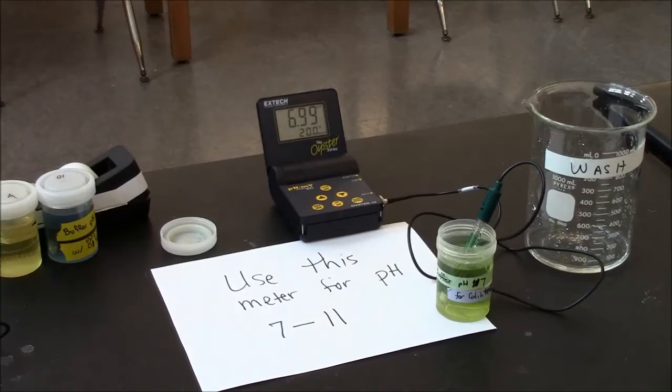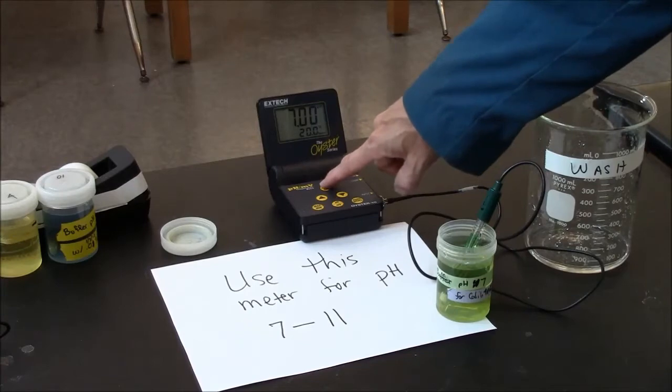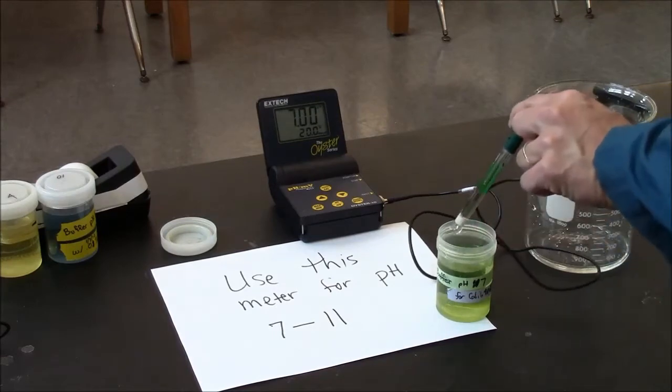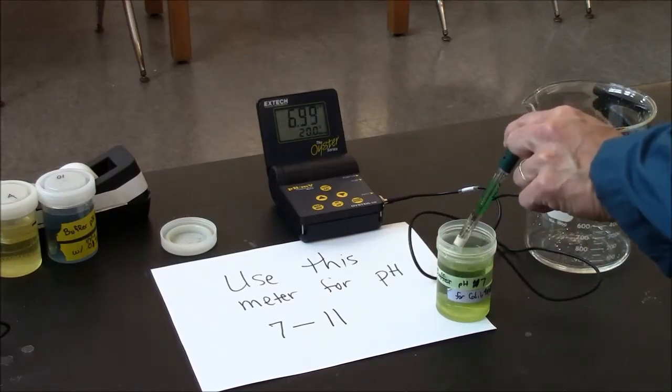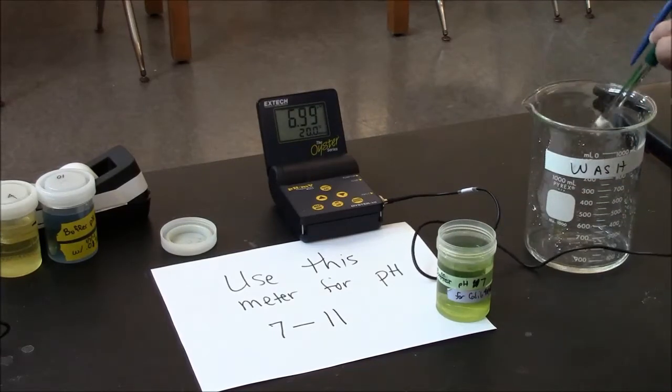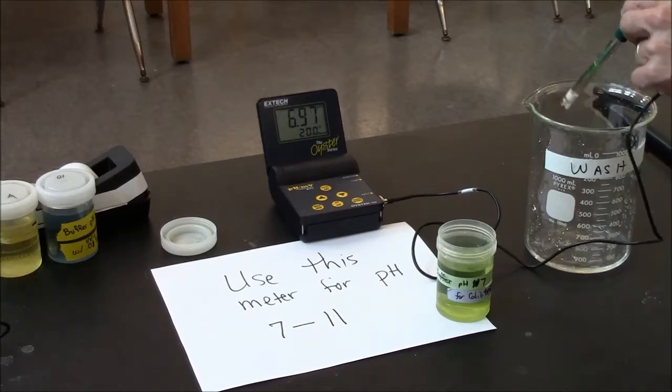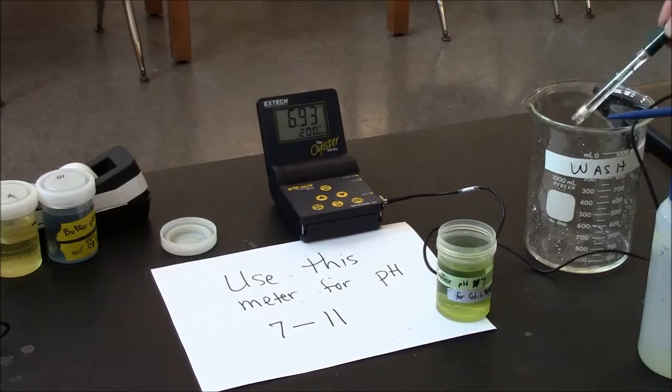A reminder on how to use the pH meter. If it's not showing anything, briefly press the power button. Take out the electrode from its resting buffer and rinse into the wash beaker with the distilled water provided. Measure your sample.